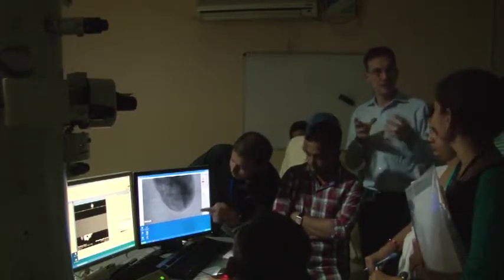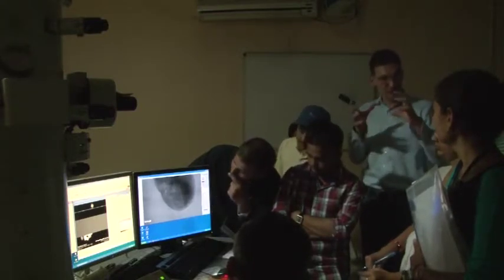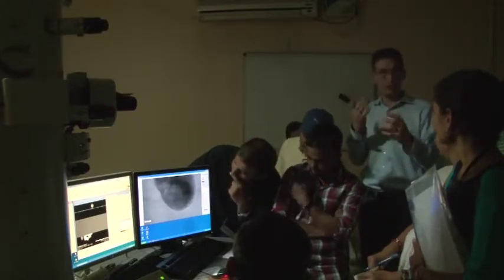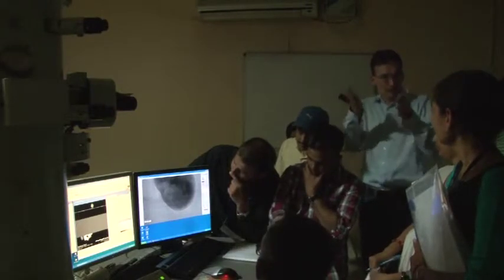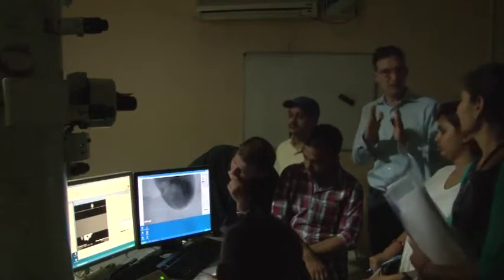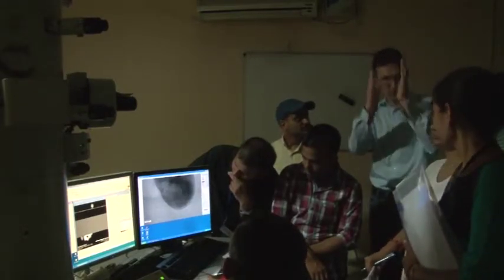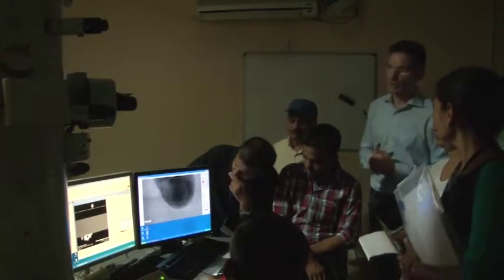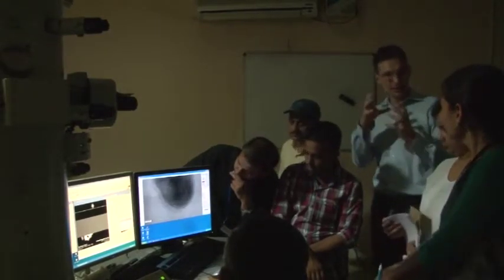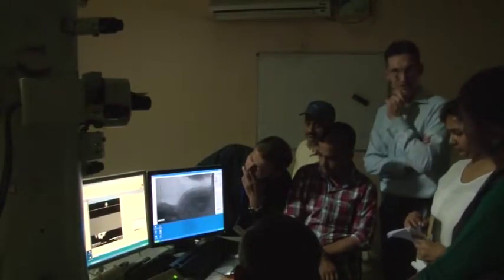You use the diffraction mode to align the sample, to align the crystallite, to tilt it into zone axis. Then you switch to image mode, and you go up in magnification to record the high resolution image. There might be some fine tuning, because between image and diffraction mode there might be a slight misalignment of the whole system. So finally you align the image mode to enhance the accuracy of this alignment.